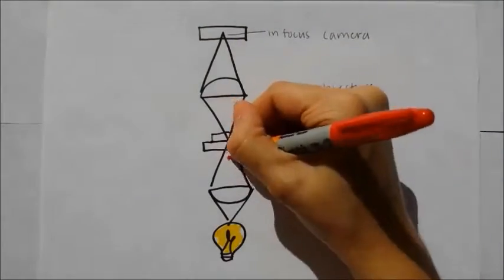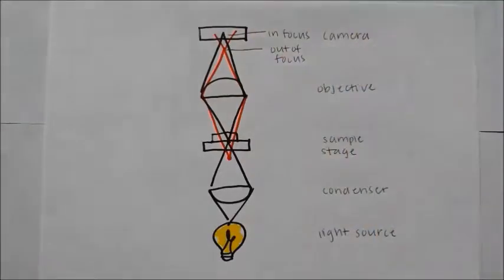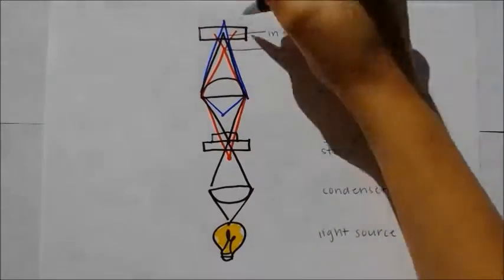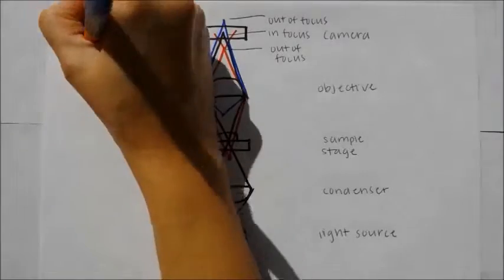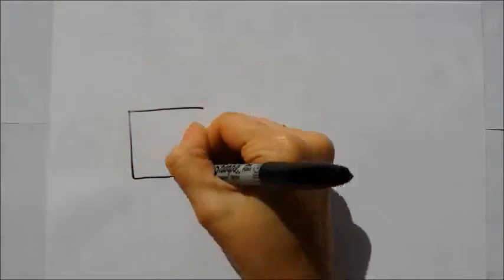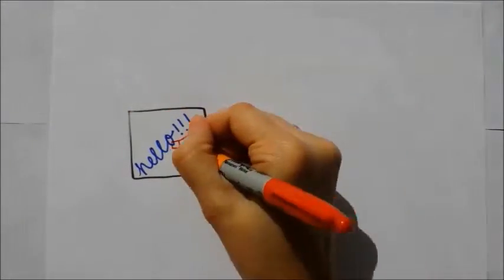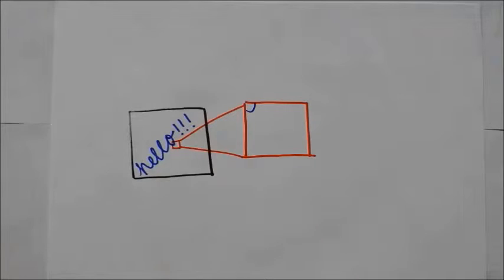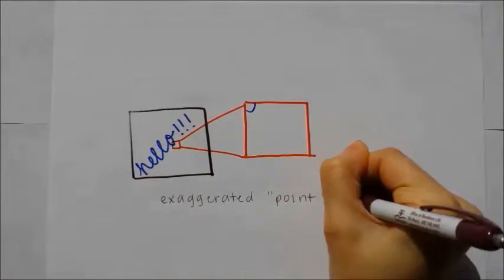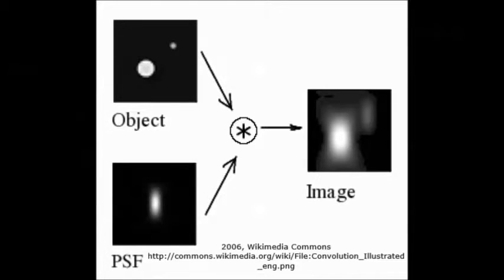The physics of an optical microscope is important because there is one focal plane, which is where you want to image, but the issue is that the light used to illuminate the sample creates many focal planes and results in an out-of-focus image. In a perfect system, if you image a one-point input, the imaging system should ideally generate an image of an identical point. Of course, this perfect system does not exist, and the blur that you see in an imperfect image is the response of the imaging system to the one-point input, which is called the point spread function. This is useful for determining the resolution performance of different objectives and imaging systems.